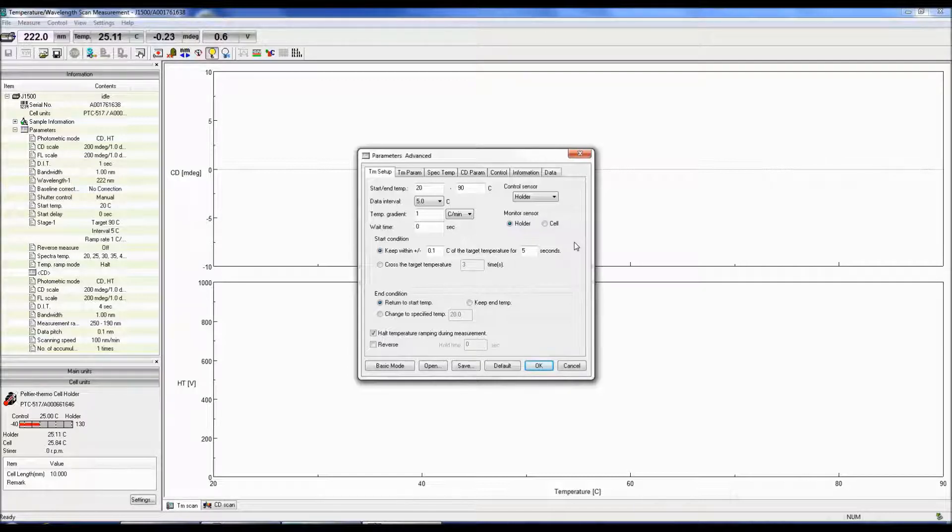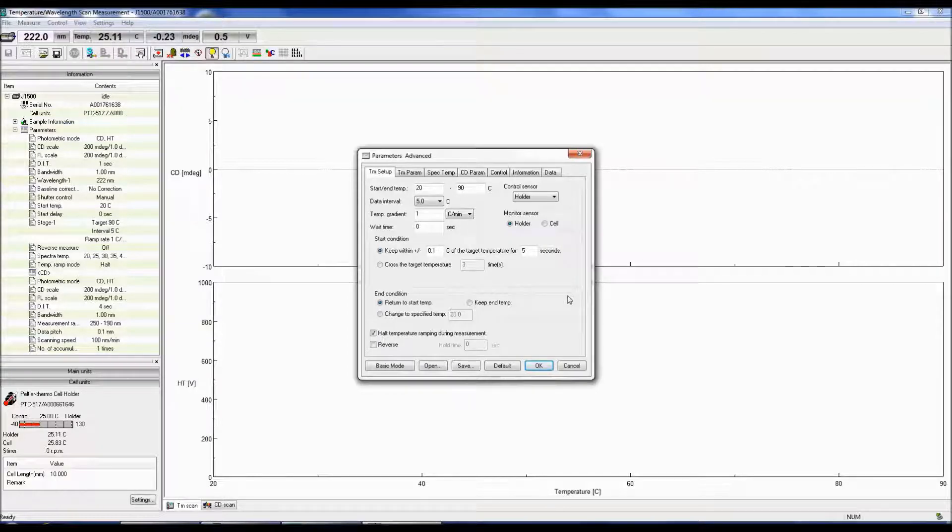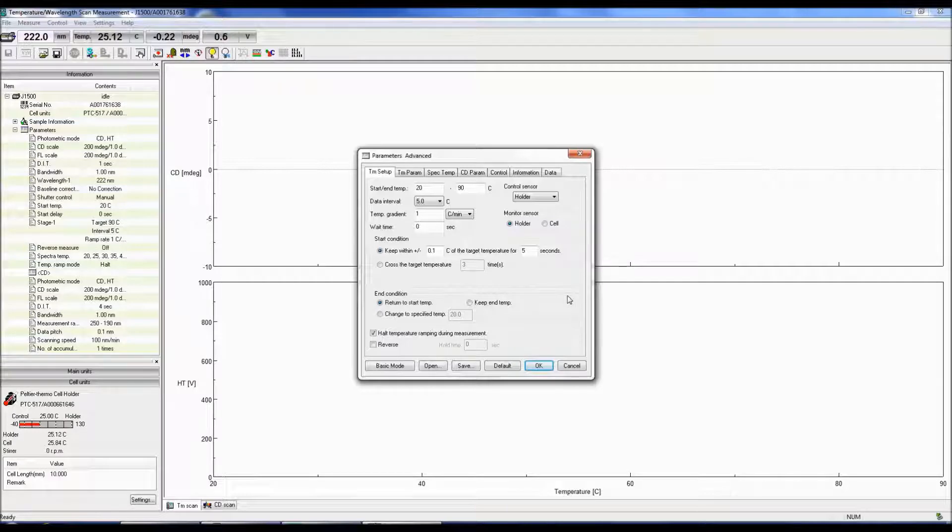Once the measurement is complete, you can either return the temperature to the start temp to check if the sample can refold, keep the temperature at the end temperature, or move the temp to a specified temperature.